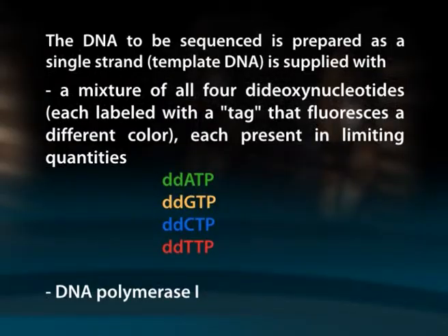Because all 4 normal nucleotides are present, chain elongation proceeds normally until by chance DNA polymerase inserts a dideoxynucleotide, shown as colored letters, instead of the normal deoxynucleotide, shown as vertical lines. If the ratio of normal nucleotide to the dideoxy versions is high enough, some DNA strands will succeed in adding several hundred nucleotides before insertion of the dideoxy version halts the process.